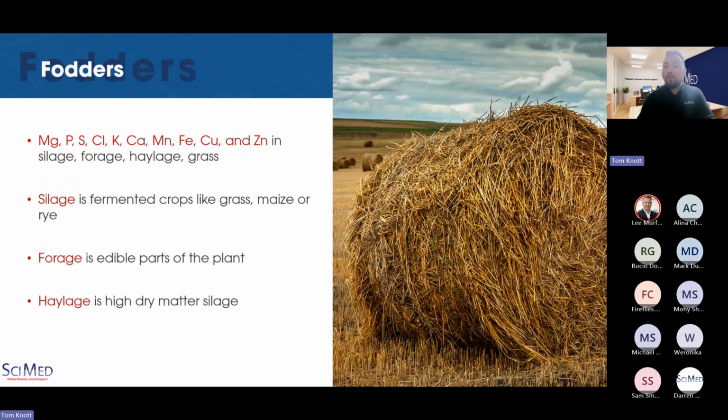And it doesn't have to be the final feeds that people like yourselves are working with. It can be, as I've already highlighted, the plant matter and foods that you're feeding the very animals that are ultimately going to need to be monitored for both the nutritional benefits and healthcare of the animals themselves, but also how that's going to impact food and human consumption down the line.